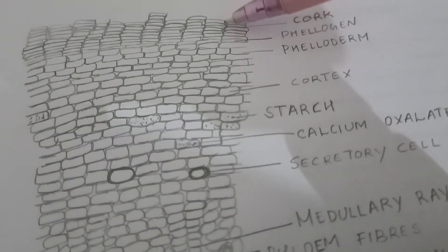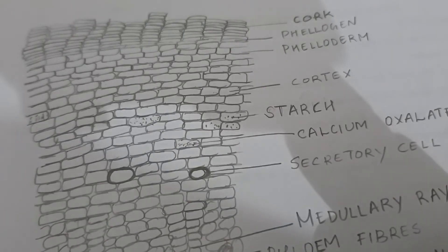First you can see the cells of the cork, several layers of thin-walled flat polygonal cells with reddish-brown content impregnated with suberine.